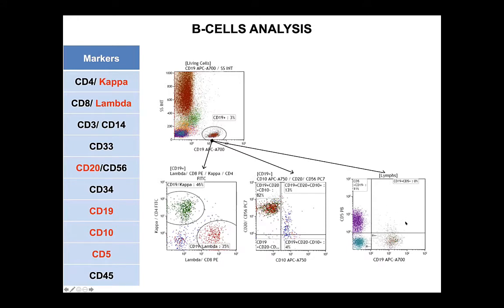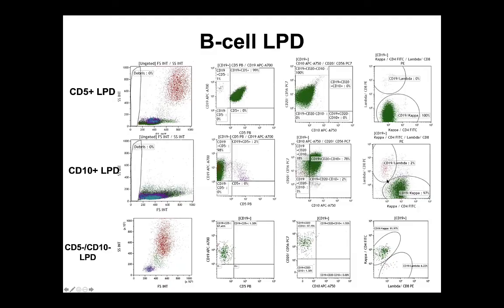We can screen for any aberrant CD5-positive B cell population using CD19 versus CD5 out of the lymphocyte population. With those antibodies, we can detect CD5-positive lymphoproliferative disorders. The other row represents a CLL case: CD5 positive, dim CD20, and dim kappa. Of course, this is not sufficient to issue a final report; additional investigation is needed. The middle row is a lymphocyte cell suspension from a lymph node — CD10 positive and kappa light chain restricted — and this is a follicular lymphoma example. We can also detect CD5-negative and CD10-negative lymphoproliferative disorders; this is a peripheral blood sample with a bright CD20-positive B cell population and kappa light chain restricted, which would require additional testing as well.